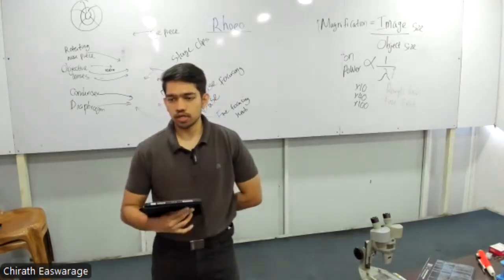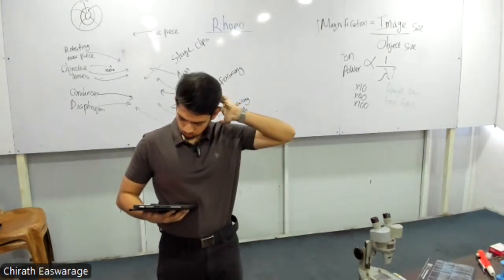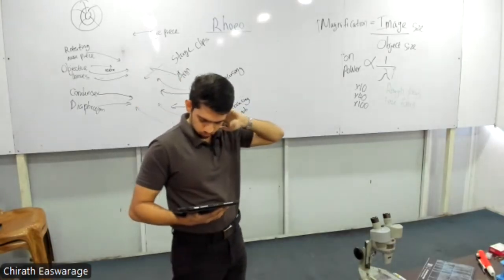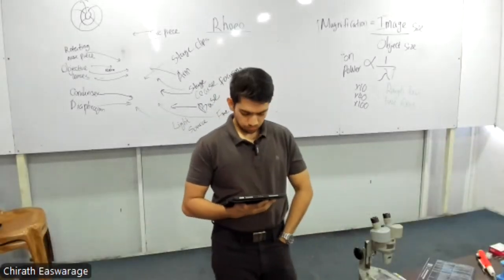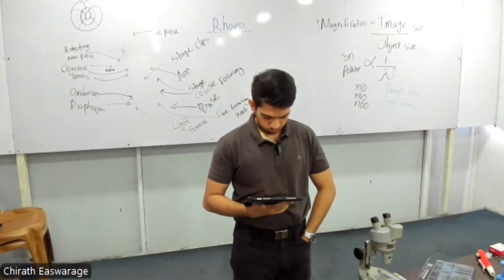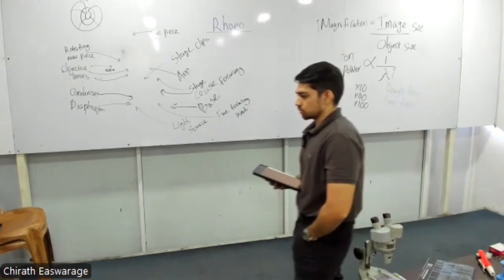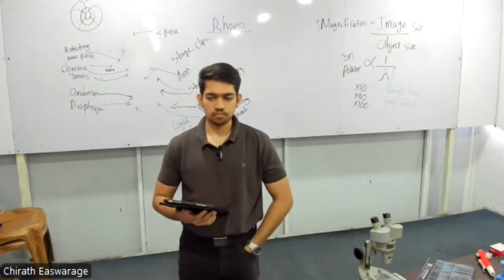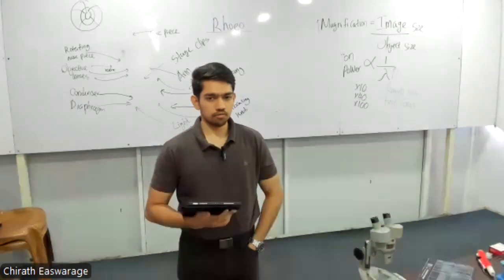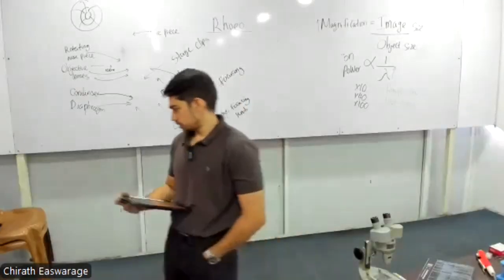Next point, using the rotating nose piece, bring medium power or high power objectives to increase magnification further. That is the practical.